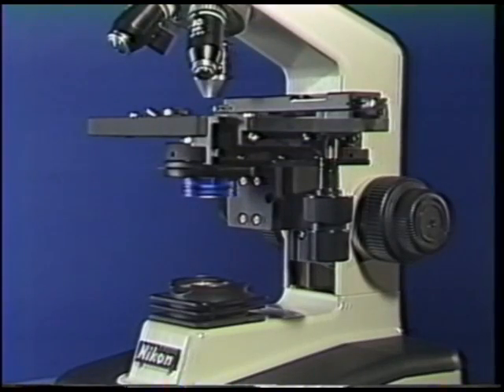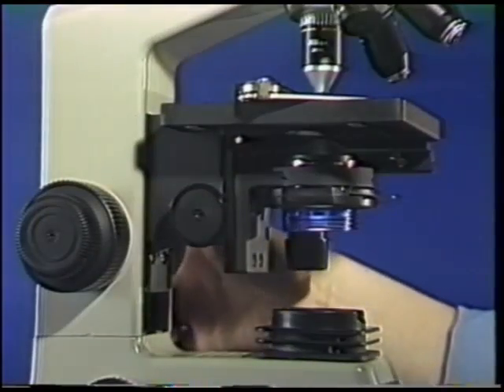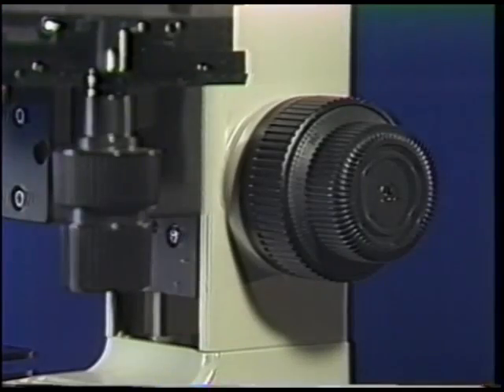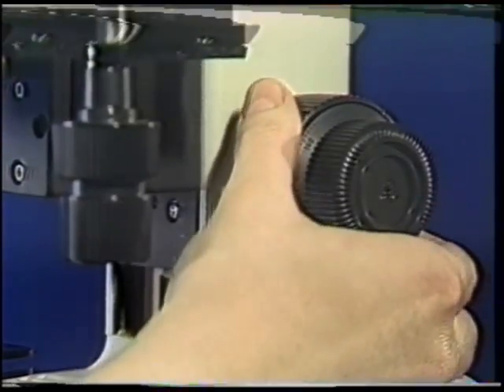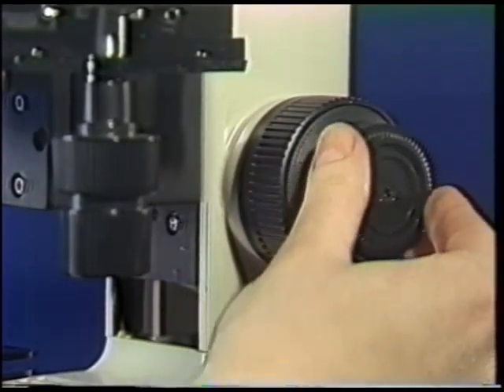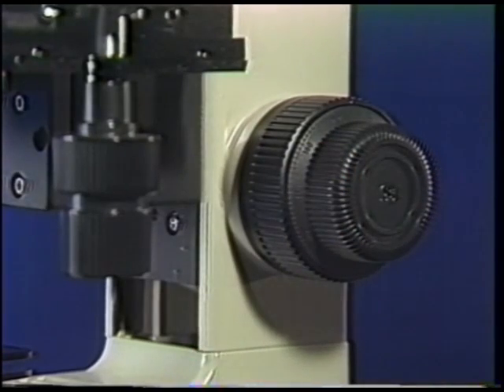The focus region consists of two coaxial focus control knobs, which allow you to focus your specimen by moving the stage down. The larger knob is the coarse control, which is used to bring your specimen into view. The smaller knob is the fine focus, which is used to bring your specimen into sharp focus.